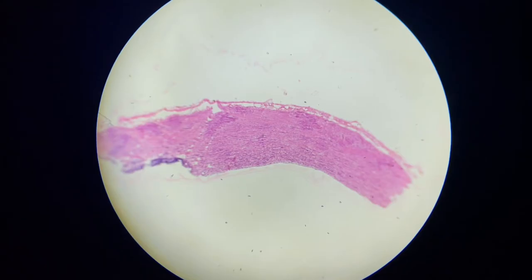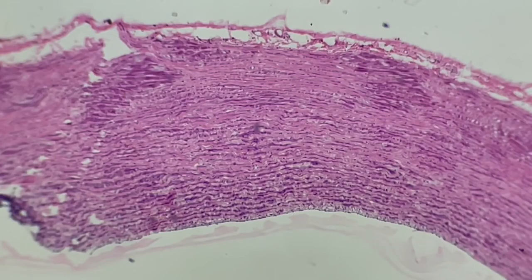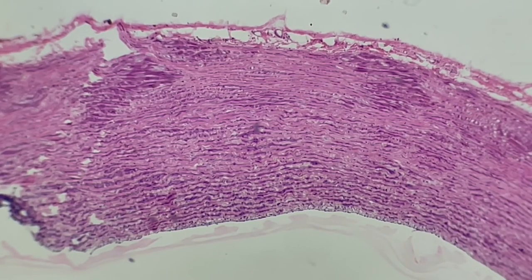Let's take a look through the microscope and see what kind of images we can get using the LabCam. Here we're at 4x looking at a section of an artery. It's an iPhone mini so it's a little hard to see the screen — it's pretty mini. I'm just going to zoom in a little bit and focus. Now switching to the 10x objective, and with digital magnification of the iPhone zoomed in three times, we're really beginning to see some really nice clear imagery.